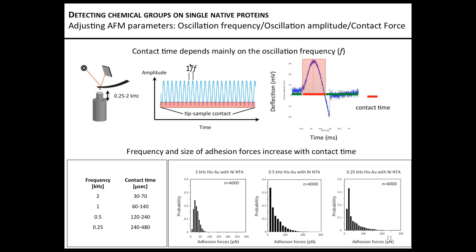And for cellular levels, it depends. I don't think the linker is so important because finally all the stretching comes directly from the cellular protein. But I think it's very important to have a diluted protein or group on the tip, and also an ethylene glycol matrix to prevent unspecific adhesion on the tip. This is very important.